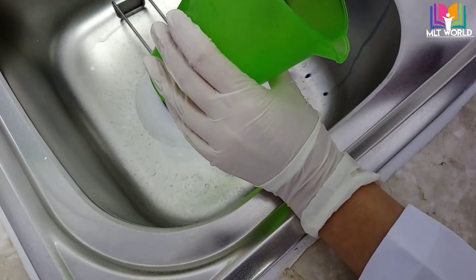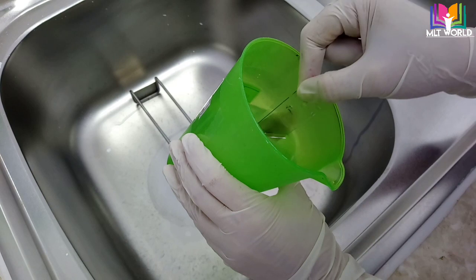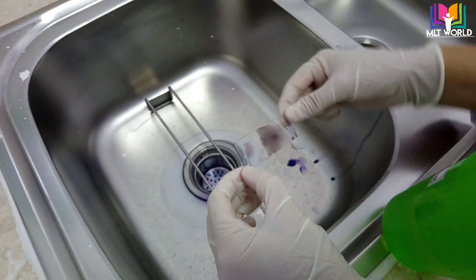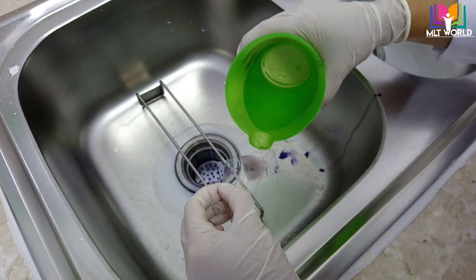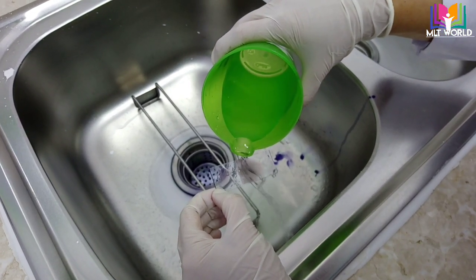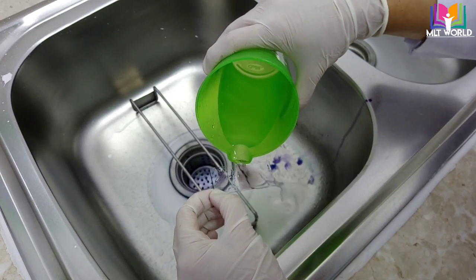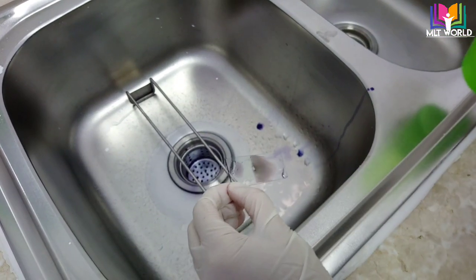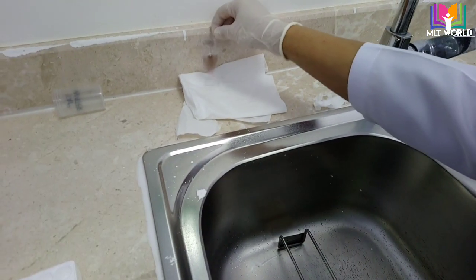To avoid washing off the thick smear, you just dip and take out, dip and take out — then your thick smear will remain intact. For the thin smear you also have to wash carefully; if you wash too fast or with too much pressure, the smear will wash off the slide. So for thick smear: dip and take out; for thin smear: wash gently with flowing water. Then let it dry.